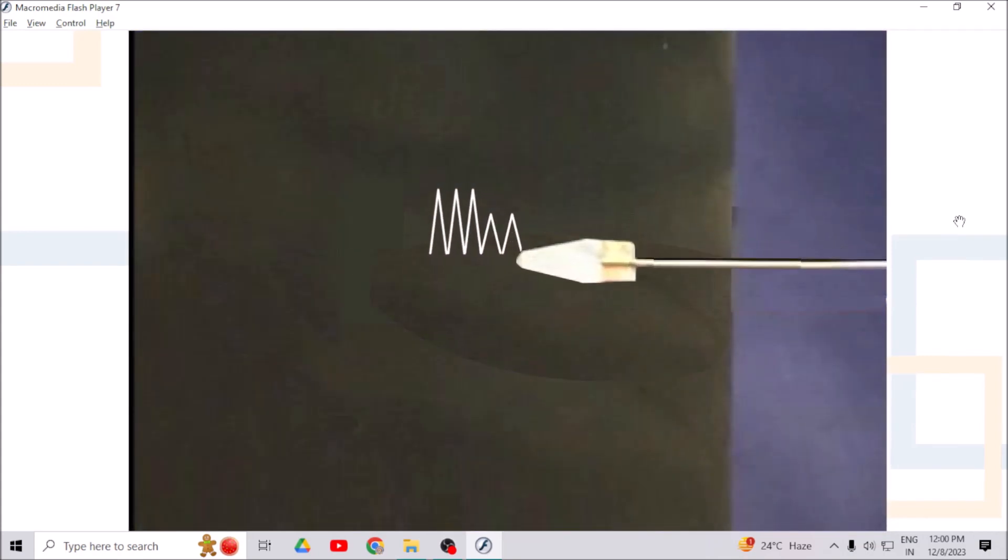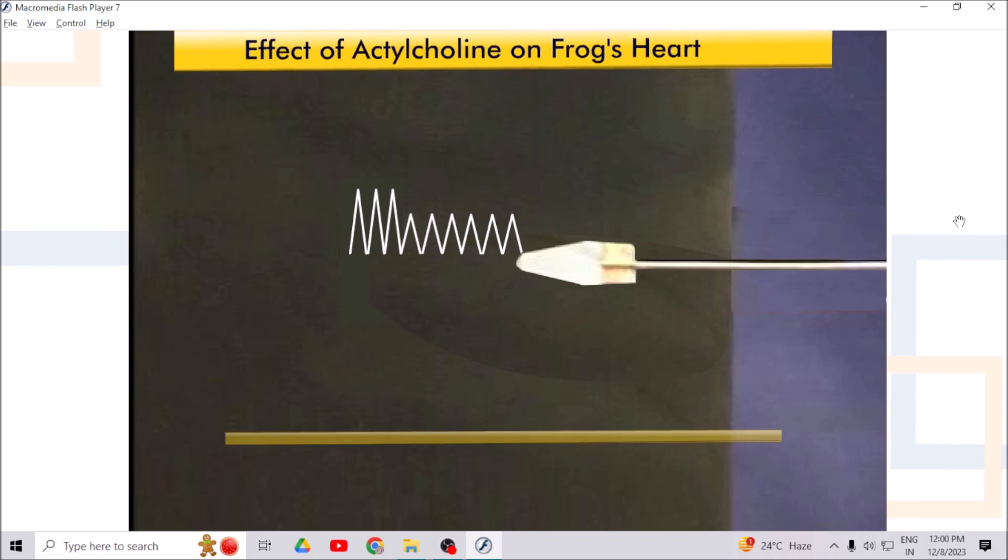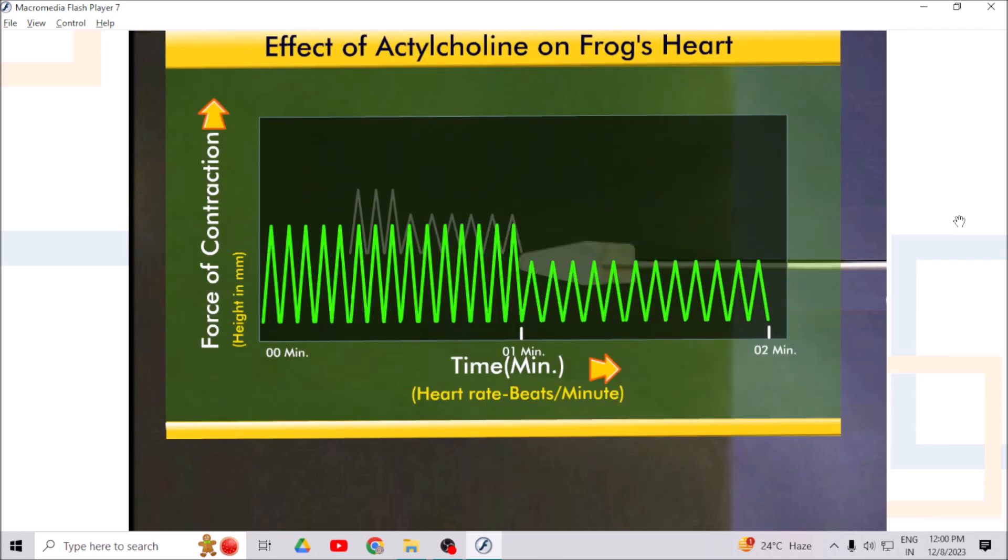Start the drum immediately and record the response of heart on the smoked paper for one minute again. You can see that the rate of contraction and force of contraction of heart decrease due to acetylcholine. Also observe the rhythmicity and tone of contraction.